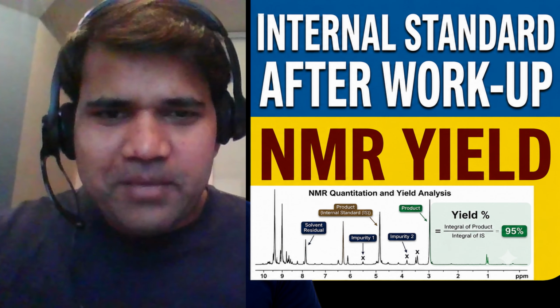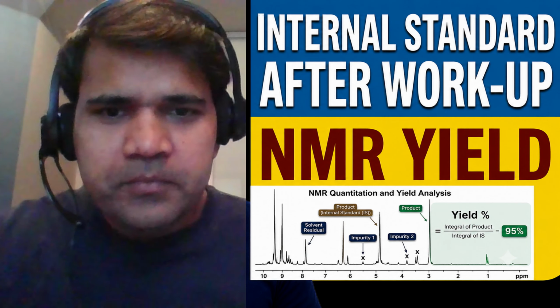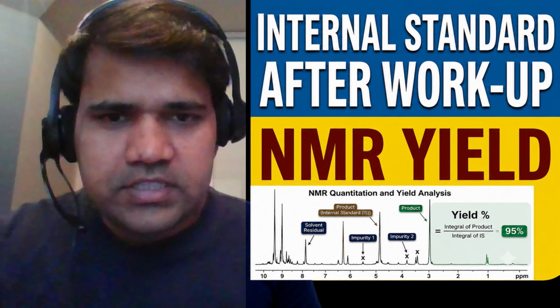As promised, I am back with another video on calculating the NMR yield using the internal standard. But in this video, we are going to use the internal standard after the reaction workup. In the previous video, we used the internal standard during the course of the reaction. This method, which we are going to discuss today, is very useful because it has several advantages, and this is the most commonly used method by chemists or researchers.